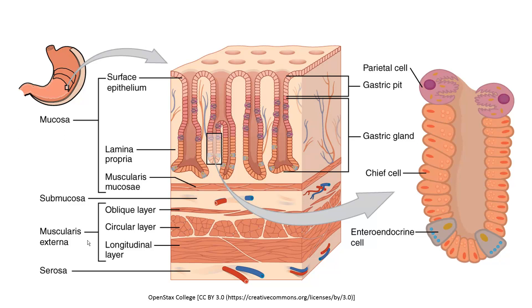The first thing you'll notice about the mucosa of the stomach is that the epithelium and the lamina propria are not in a nice wavy single layer like we saw in the esophagus. Instead, the epithelium and lamina propria of the mucosa are invaginated — pulled downward into a pocket — so that at the surface we have these holes, and in cross-section we can see these holes lead down into this invagination of the epithelium. Most of the epithelial surface area is not exposed to the lumen of the stomach, which is full of gastric juice.